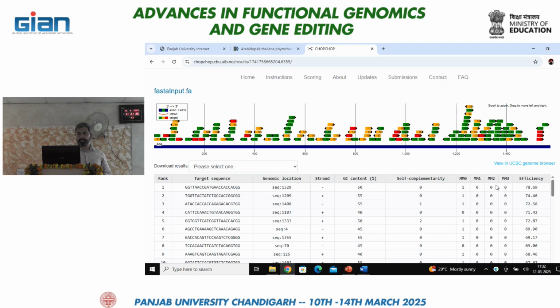These are mismatch numbers, like with one mismatch your sequence is binding with some other target, in another region. So I think this tool is making it look a bit complicated, but when we use a different tool like CCTop, it is more understandable.